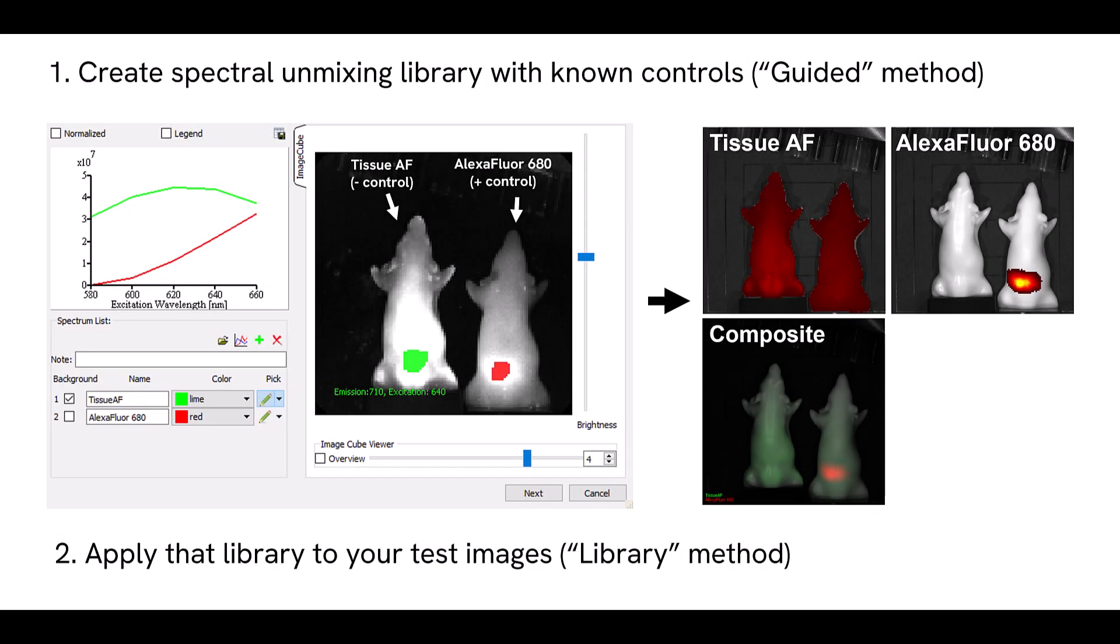The first step in spectral unmixing is to generate a library from known controls. After generating the library we can apply it to test animals that contain a mixture of probes to separate the signals. Saved libraries can be reused in subsequent time points of a longitudinal study. A library can also be reused in later imaging studies where the probes, mouse strain, and filter selections are the same.